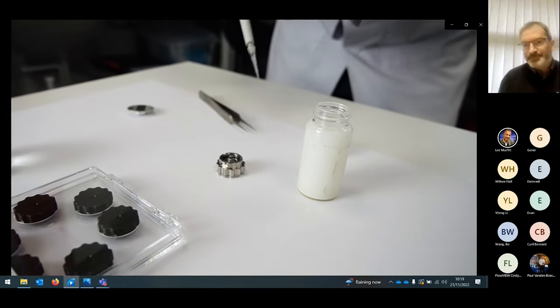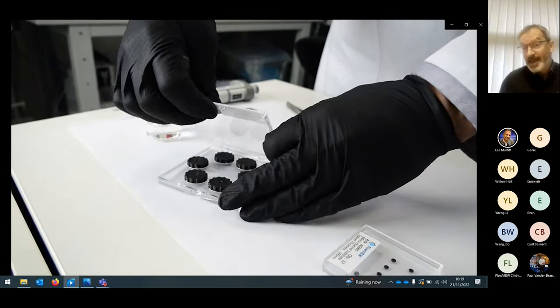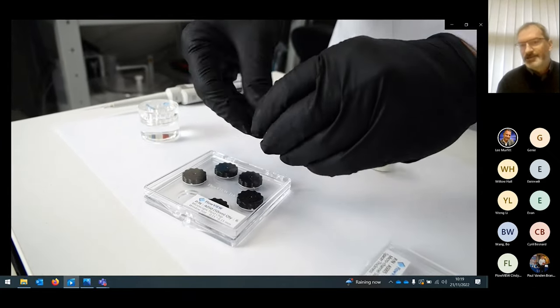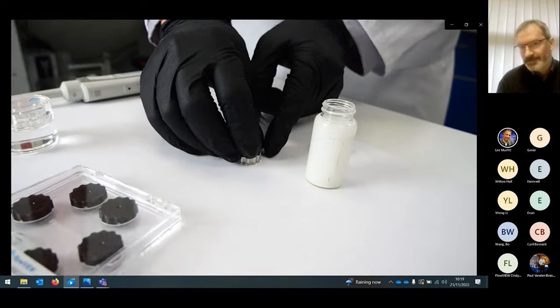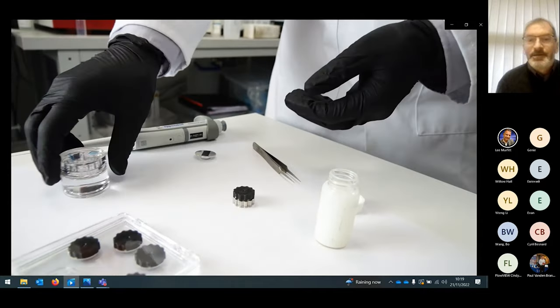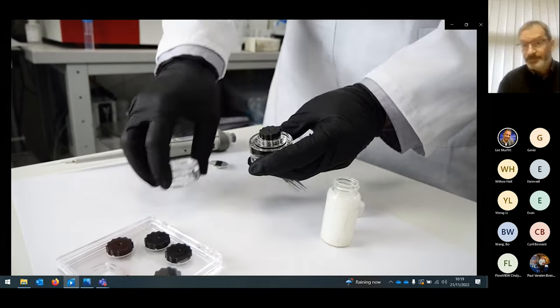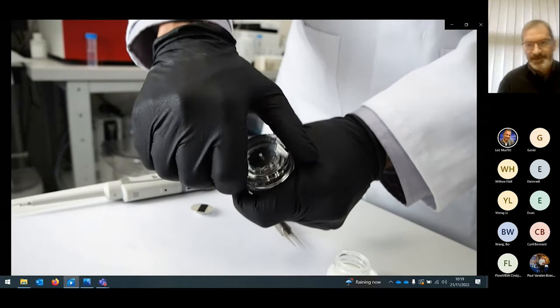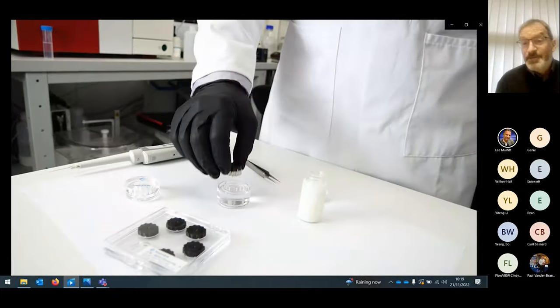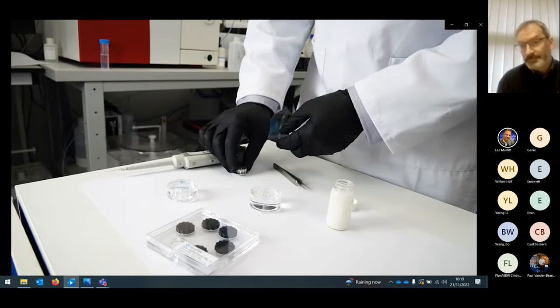Cerium oxide is quite a good emitter as it's a heavy element, so it gives us some nice backscattered electron images — a nice easy sample to start with when first using the system. Basically you drop about 10 microliters onto the top of the holder. You want an excess so that you don't have any air bubbles in the system. Then we take the chip, which contains the very thin silicon nitride membrane. You just pop that on, finger tight, and then use the custom tool supplied by FlowView Tech to tighten it.